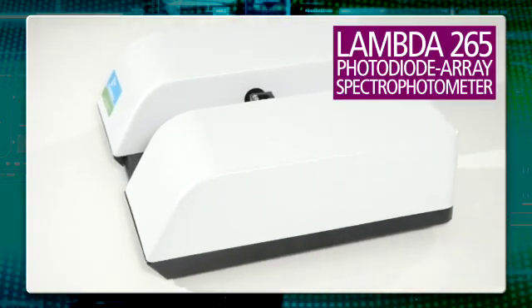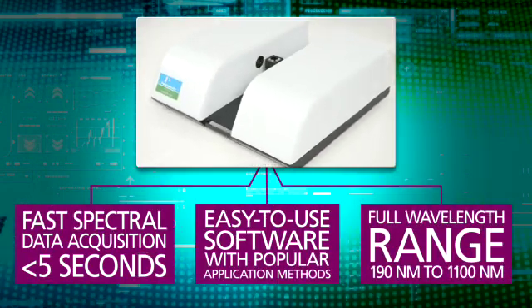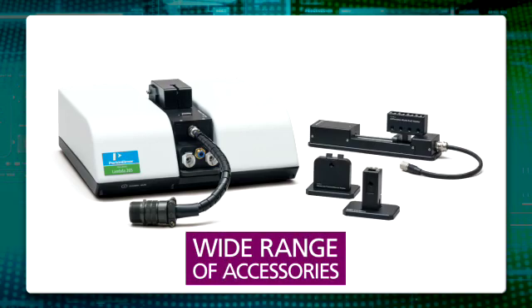The Lambda 265 photodiode array spectrophotometer delivers fast, accurate results at an affordable price. Accessories for the Lambda 265 are magnetically mounted and software calibration eliminates the need for any tools. Now everyone in your lab can be productive right away.